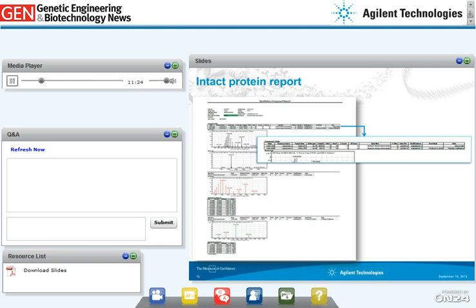The Agilent MassHunter BioConfirm software provides automated data extraction, deconvolution to zero charge, and protein confirmation. Reports show a table of matched protein sequences and a compound table showing different molecular species and their relative abundance, as well as the total ion chromatogram and total compound chromatogram. The report also identifies impurities not matched to the protein, suggesting process-related impurities. In such cases, the report helps researchers optimize purification methods to remove unwanted impurities in the next cycle.